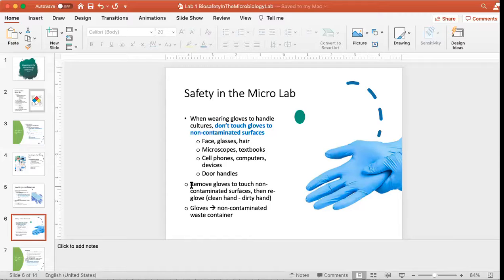It's a common practice in many different types of labs to do what's called clean hand, dirty hand. In other words, imagine if you're in a laboratory and you're doing an experiment or you're running diagnostic samples and you have to record the results while you're doing the work. It's very common for people to have a gloved hand that they can use to touch things, and an ungloved hand that they can use to record results. That's what we call clean hand, dirty hand.